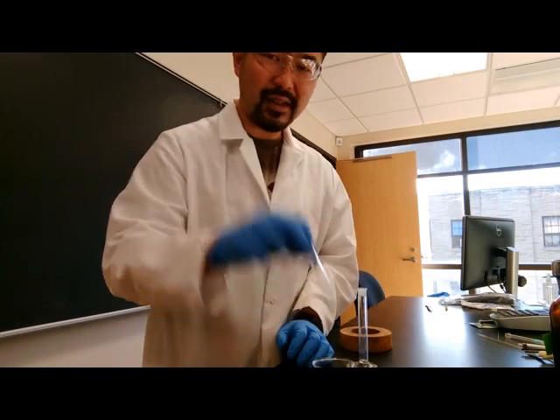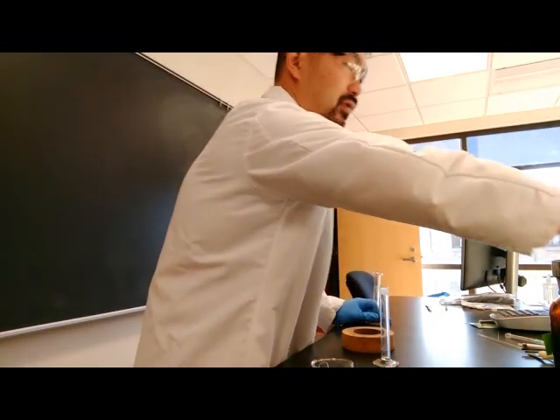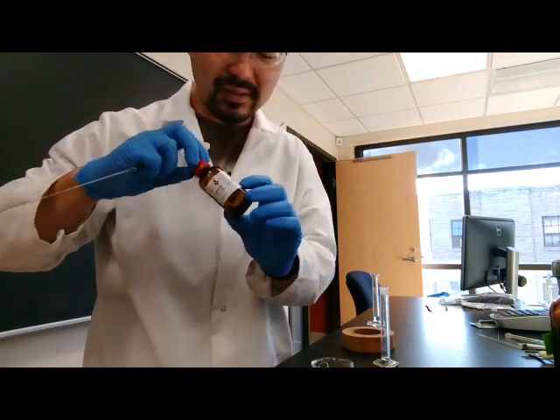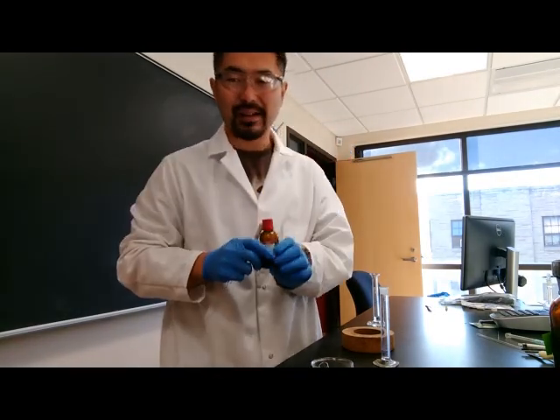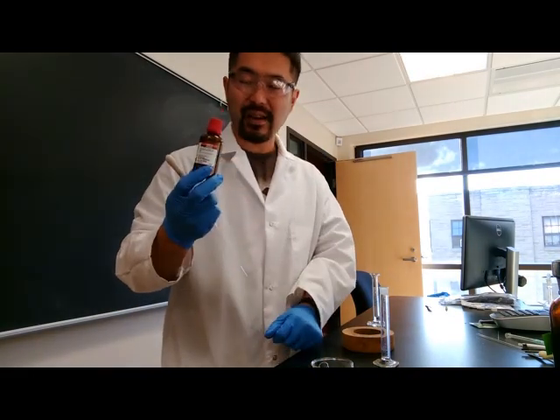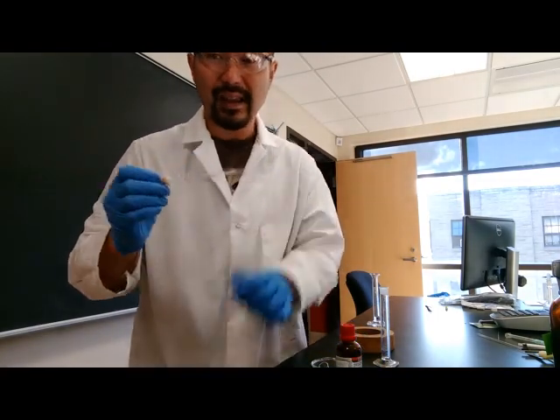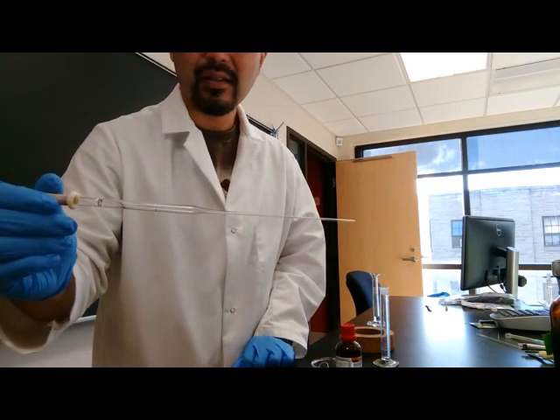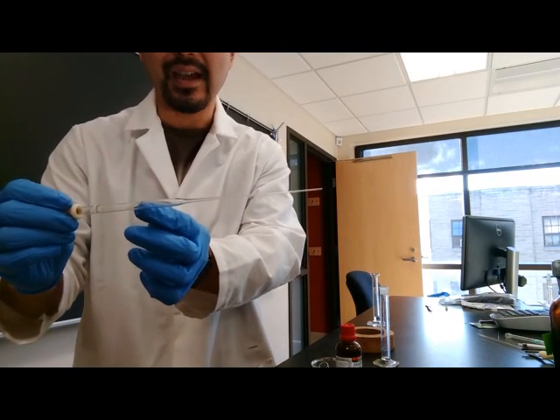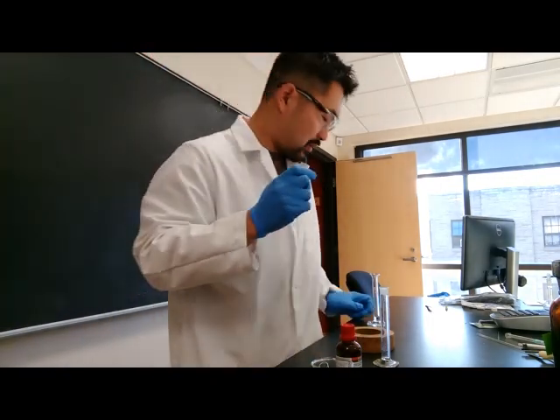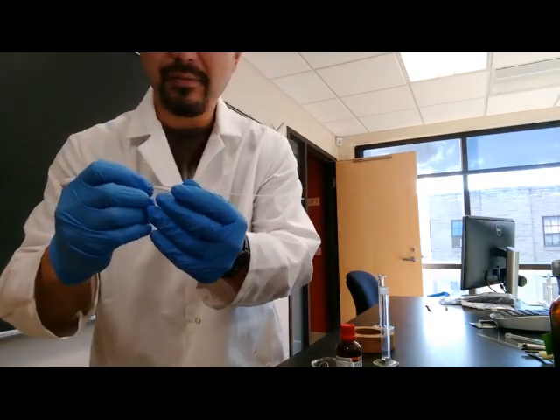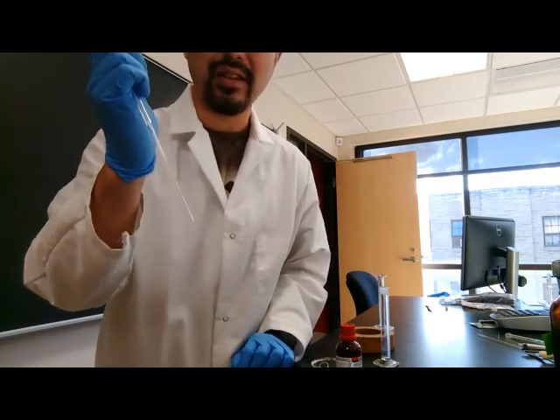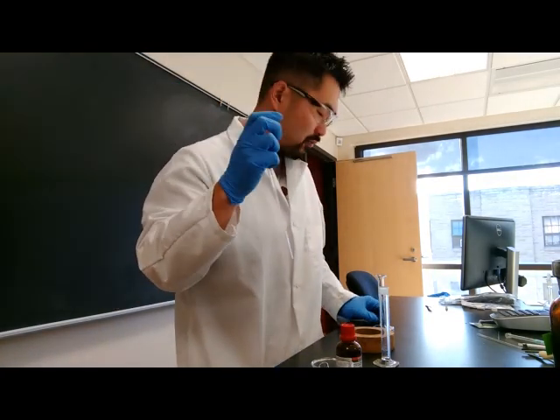Once you have your sample in either a test tube or in the unknown sample vial, you will want to dissolve that in deuterated chloroform. It usually comes in a bottle like this and make sure it says deuterated, not regular chloroform. And I'm not going to use this right now because this is a very expensive solvent. And for that reason, I want you to be very careful about how much of this expensive solvent you use. You will want to obtain a calibrated Pasteur pipette. I don't know if you can see the black line here. I've calibrated this so that the line here represents one milliliter of liquid when I take up liquid.